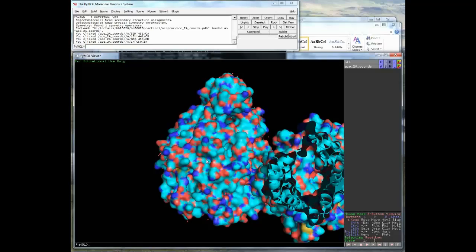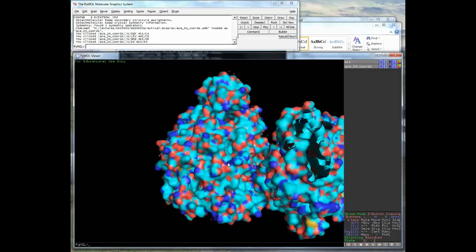And you can actually see, it's quite interesting here, that these little stars, which are the waters, you can see how they fit in the pockets, which is why they've probably bound tightly to the protein, because they've sort of gone into a pocket and they've bound there.